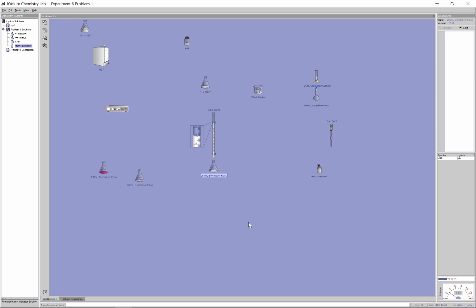So now I'm going to drag it over top of my Erlenmeyer here. I know from my second trial it's about 9.79, so this time I'm even more confident. I know the 11 mL mark is here. I'm going to transfer in 8 mL, or you basically open it until it's about 19, because that should be totally safe, right? Both of them didn't change color until it was about 9 mL something. So that's 8 mL in the solution. Let's transfer in 1 mL, so that it's 9 mL now. Let's transfer in 0.1 intervals here. So 9.1, 9.2, 9.3, 9.4, 9.5.